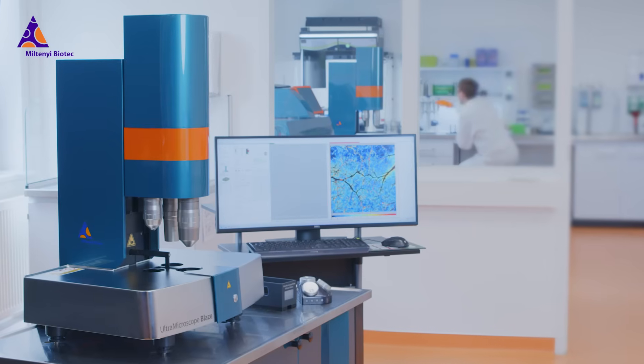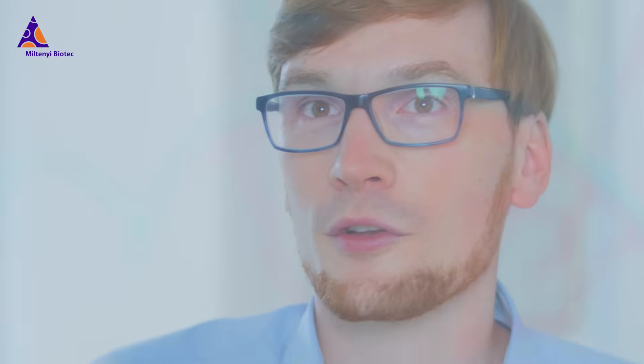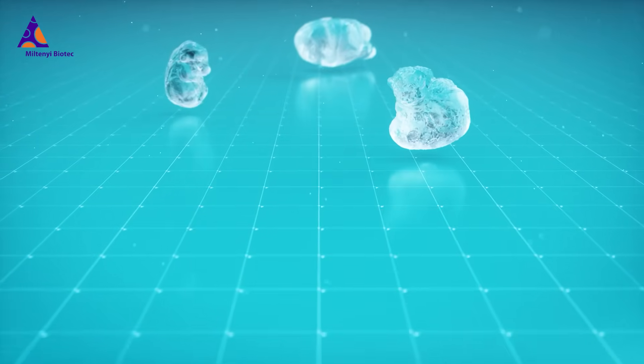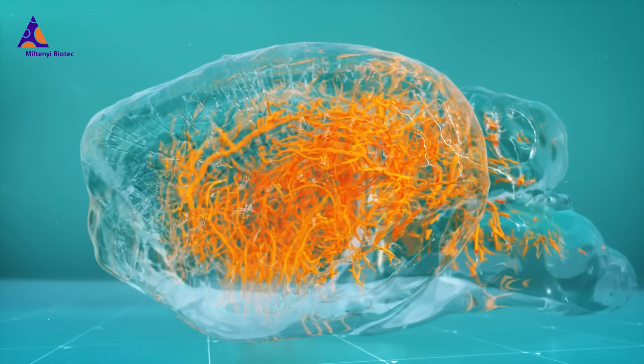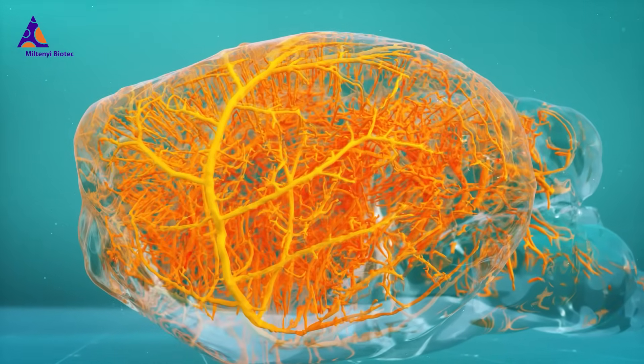Even if you're not an expert, the Ultramicroscope Blaze Light Sheet Imaging System lets you easily create detailed 3D images of entire rodent organs, or even a whole mouse, without sectioning and with minimal training and hands-on time.